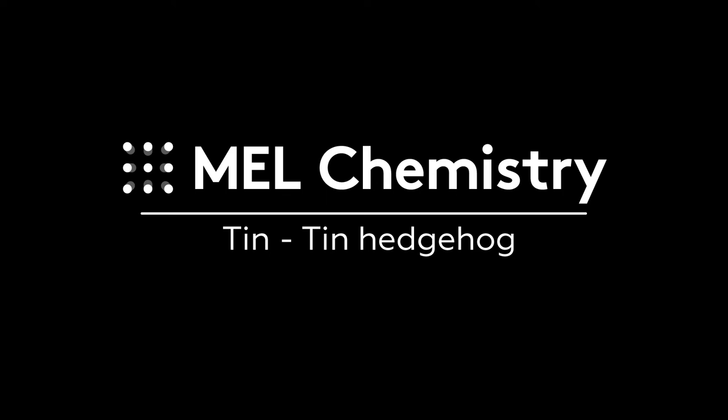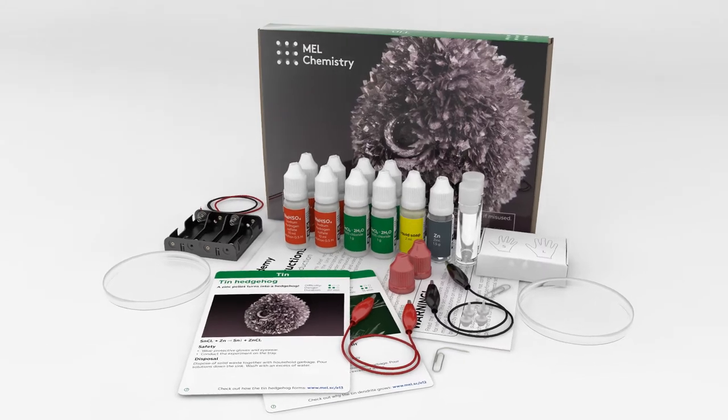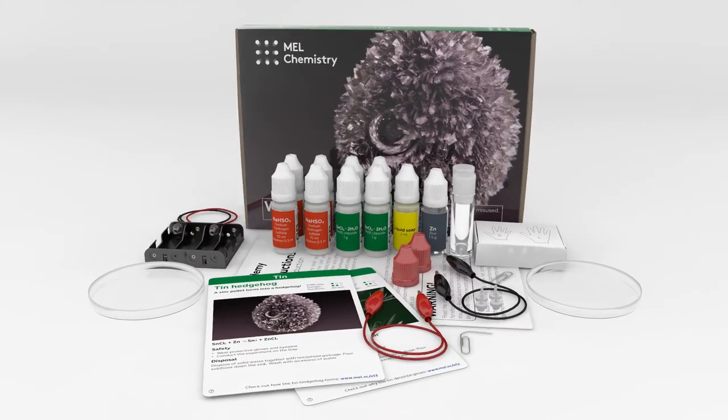Welcome to the wonderful world of chemistry. Today, with the help of the Tin Set by Mel Chemistry, we will make a Tin Hedgehog.